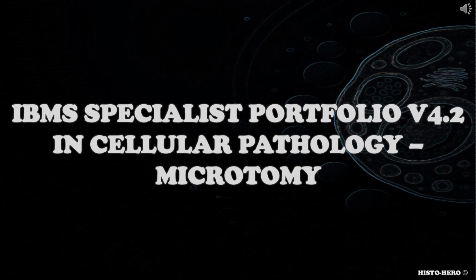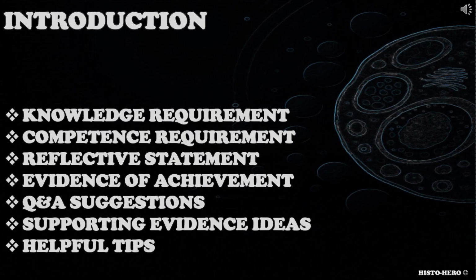And today's video will be about microtomy, which is part of the IBMS specialist portfolio in cellular pathology. So, just a quick introduction to this video. It will be short and sweet, I promise. It will be focused on the fifth subsection of the specialist portfolio called microtomy.